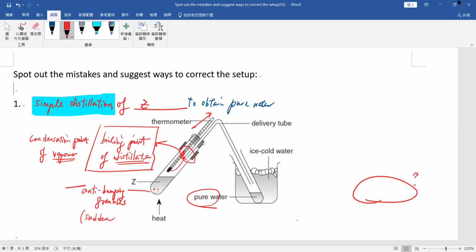Yep, sudden burst. So the rapid vaporization of a large volume of liquid. And then, what is the consequence? You will have a sudden splashing of the solution, because of the accumulation of too large bubbles that come out. This is the gaseous stage of the product.